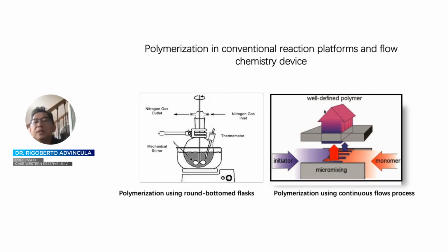Ergo, what happens is that you are able to control the heat diffusion or the thermodynamics as well as the kinetic control more precisely compared to a batch, by simply confining your reaction where the reagents mix at the mixing juncture. Thus, with that control, one is able to continuously feed the monomer and initiator, or the two reagents. And as long as you continuously feed the reaction, you are able to isolate the product.